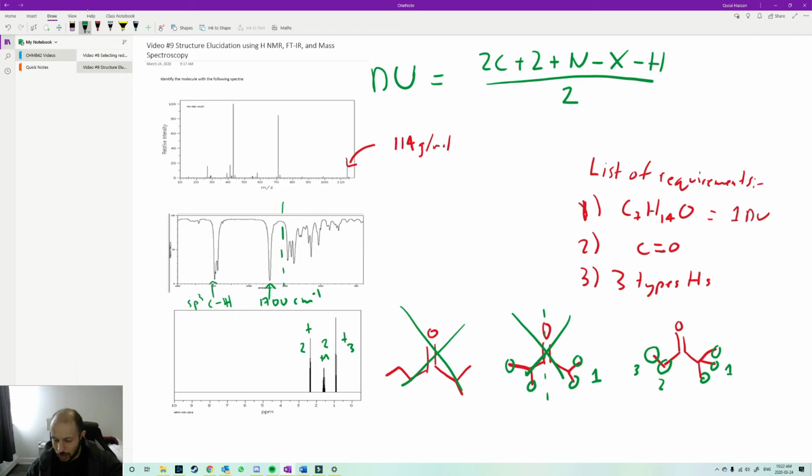But wait a second, okay, what is the splitting of these 9 hydrogens, first of all? Because I have one CH3, CH3, CH3, that's 9 hydrogens, right? What's the splitting of that? Well, the splitting is actually just going to be a singlet. Because there's nothing there. There's no hydrogens adjacent to these CH3s, right? I don't see a singlet here. Also, given that this represents 9 hydrogens, I don't see an integration number where it's 9.